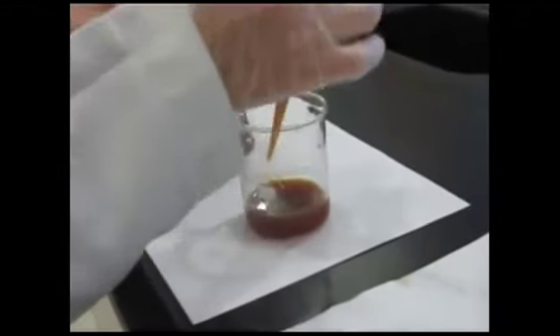Then shake it. If a red ring appears, it means the sample is positive for carbohydrates.